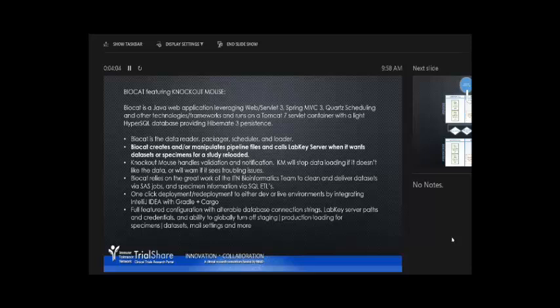Knockout Mouse is the part of it that handles validation and notification. There are many different things that can go wrong with the data when you're reading somebody else's database. I keep thinking that I found all the different ways. Some warnings will come in. We'll find that the ETL, this has only happened once, so not some warning. And this was in the early stages before I had thought to put in that validation, and the entire table was empty. And the very first pre-alpha version of this program happily ran and loaded up empty specimens to our staging server. And it's a good thing it was the staging server, because it completely wiped out pretty much all of our specimens.